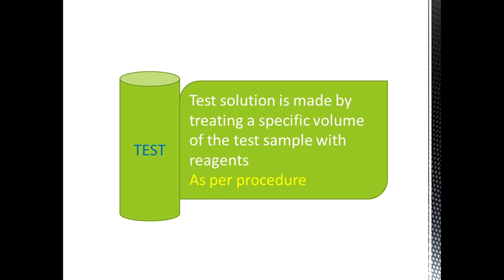Next is the test. Test solution is made by treating a specific volume of test sample with a particular reagent as per the procedure. There are different chemicals used for that, or different procedures.